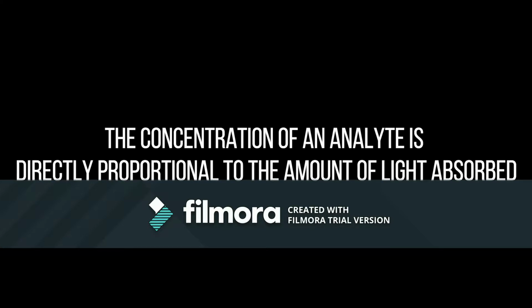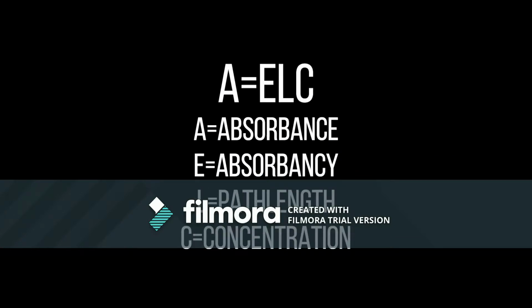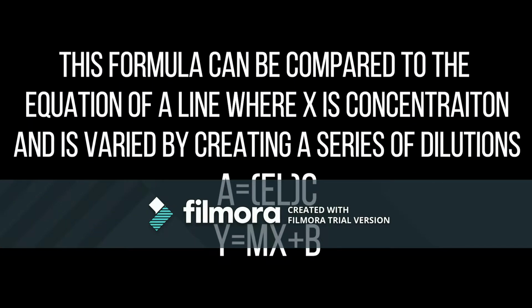The Beer-Lambert law states the concentration of an analyte is directly proportional to the amount of light absorbed. It's represented by the equation A equals ELC. This formula can be compared to the equation of a line where X is the concentration and is varied by creating a series of dilutions.